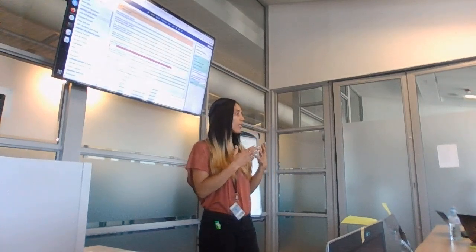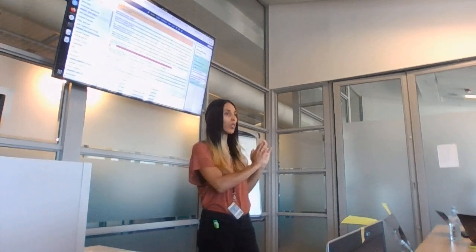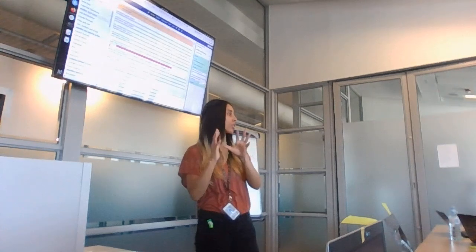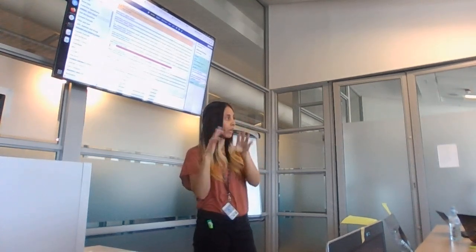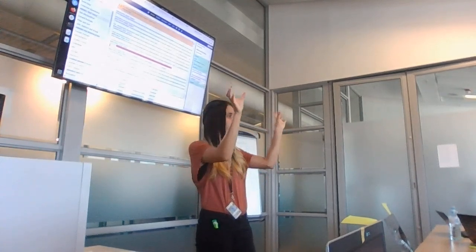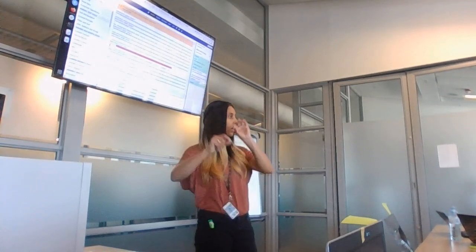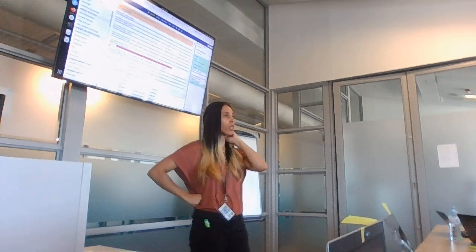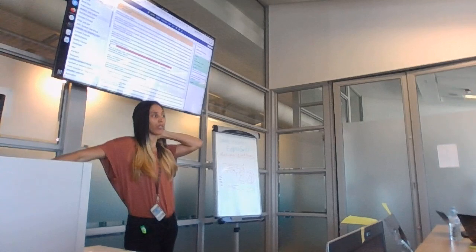In the same way that you would keep one copy of your reads somewhere that you haven't done any analysis on, and work on the other ones. So I would make a copy of it and then use the one history to do all my analysis, and then that one can be used to, like we did when we put the history side by side, drag files into wherever I want when I need it. Yeah. Because it's difficult to drag from, maybe it's possible, but we haven't been able to figure out how to drag from a collection.